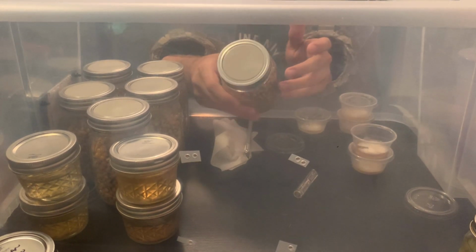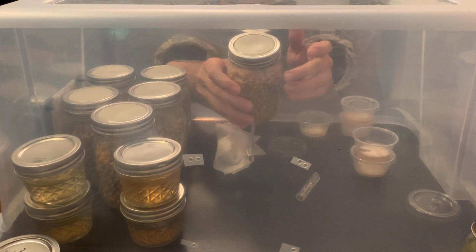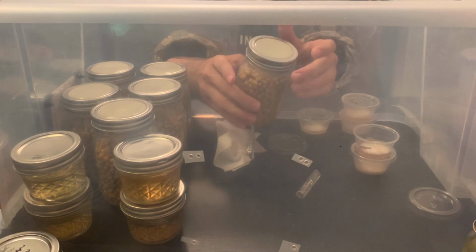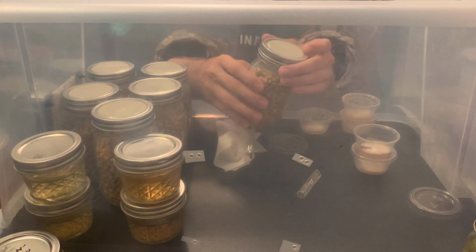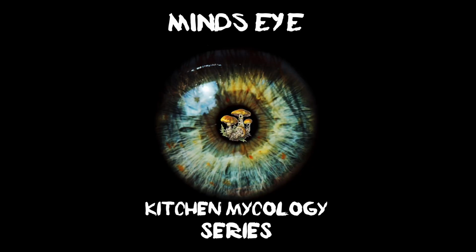Once again, some people do this differently. Some people shake it after they just see a little bit of growth. Some people don't shake it at all. Whatever works for you, whatever you want to do. This is just a rough field guide of how to do this. Okay, so I forgot to add the spore syringe part, mainly because I don't use spore syringes anymore. But if you are using a spore syringe, at this point, you would want to put anywhere between 0.5 cc's and 1 cc into your jar, and then just close it back up.